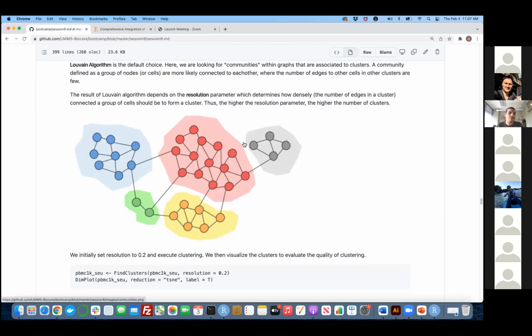Let's say that you have some T cells. Of course, T cells will be very close to each other. But you may have additional cell types within T cells, like effector T cells and naive T cells. Even though they have some signal indicating that they are lymphocytes or T cells, they are going to have some specific markers as well in order to pick them up. But it is our job to play with the parameter and keep discovering these cell types.